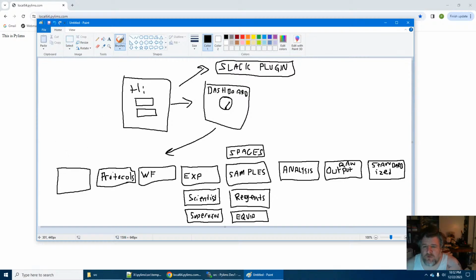Alright, so who owns a protocol? I want a user too. Well, so what we know is we have an organizational flowchart. We're going to have organization, that's like everybody. Then we will have department.